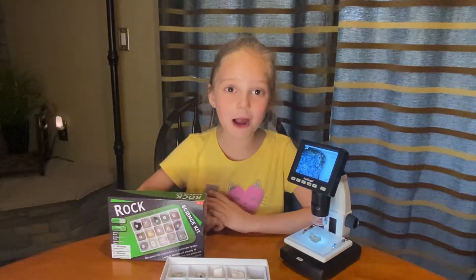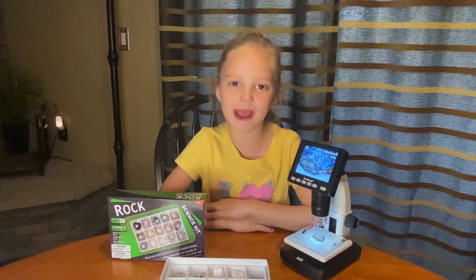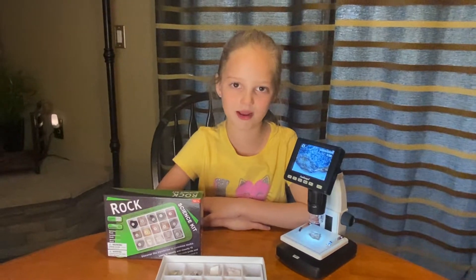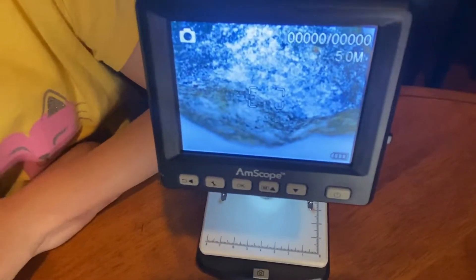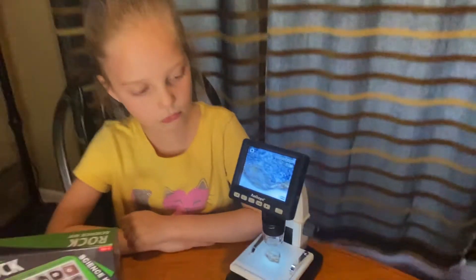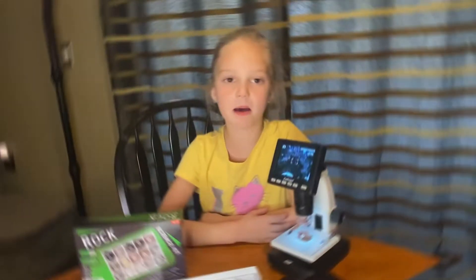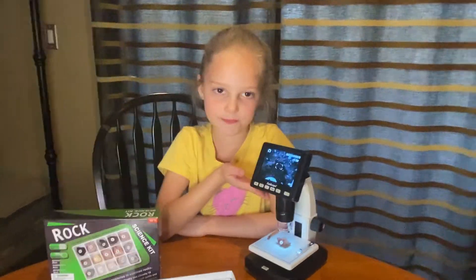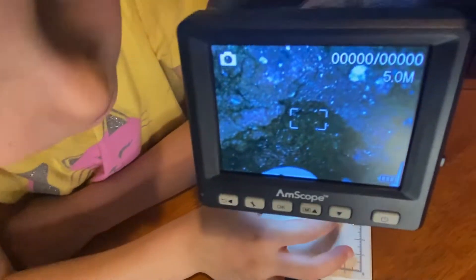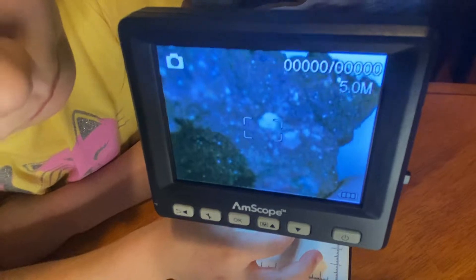Hey guys, I'm going to show you some of my cool rocks on my microscope. Here we have granite — check it out. Cool, right? This is a pumice stone — check it out. Cool, right?